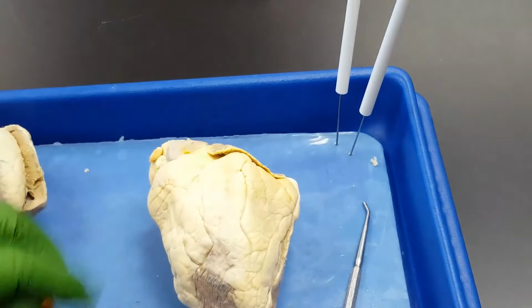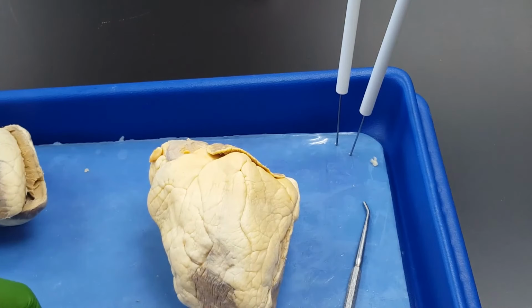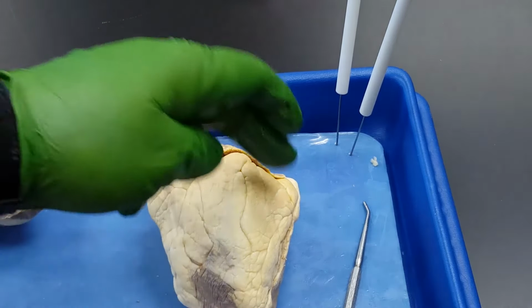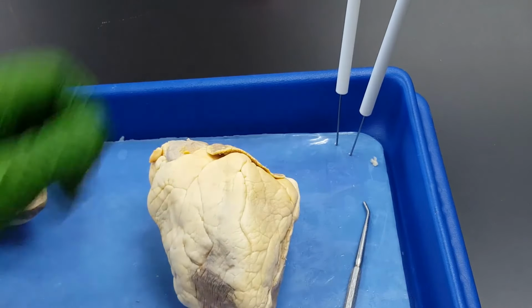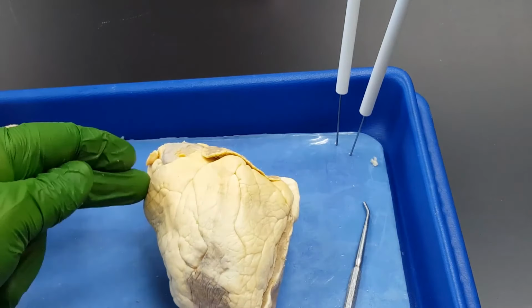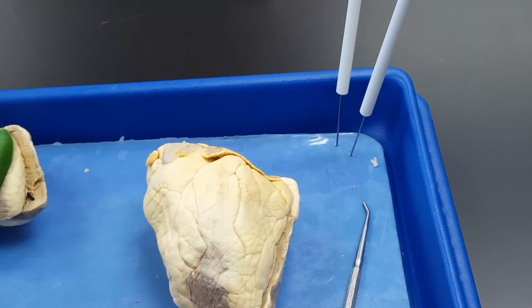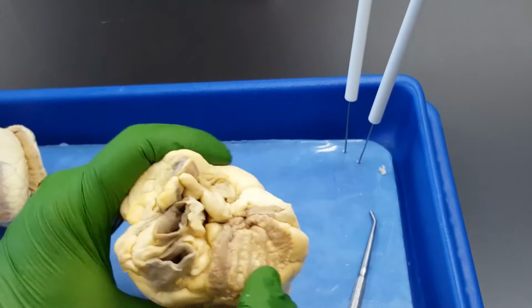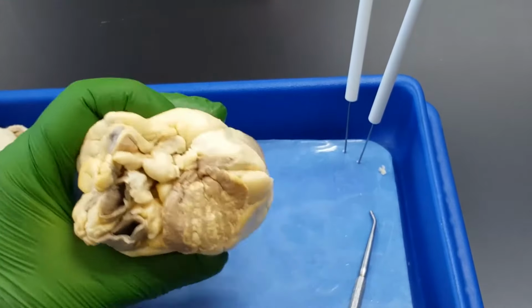The other great vessels we have are the superior and inferior vena cava and the pulmonary veins. These are the great vessels attached to the two atria of the heart. Pulmonary veins going into the left atrium, vena cavas going into the right atrium. But again, we have a problem with, first, the nature of a sheep, and second, the way these things are cut. So I want you to look at the top of this heart.